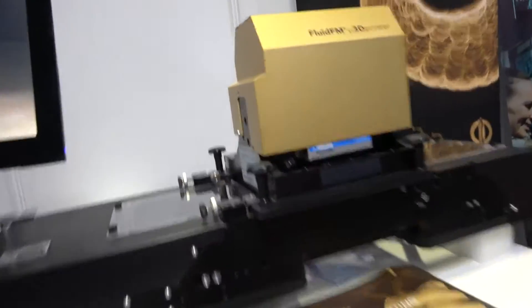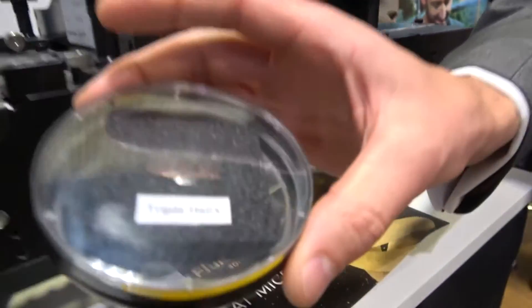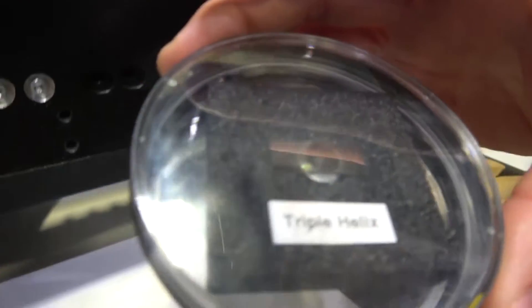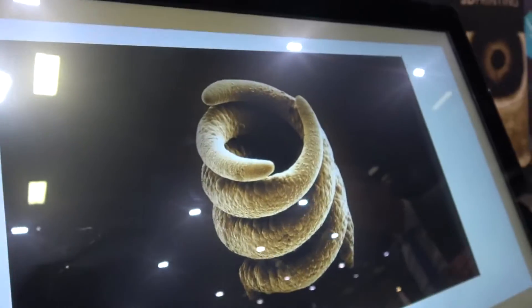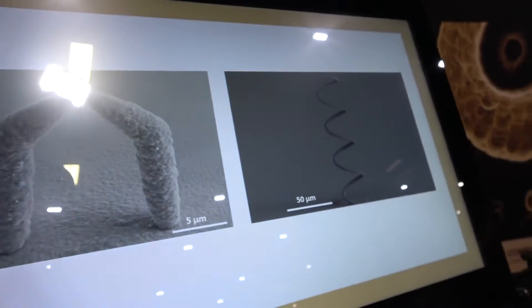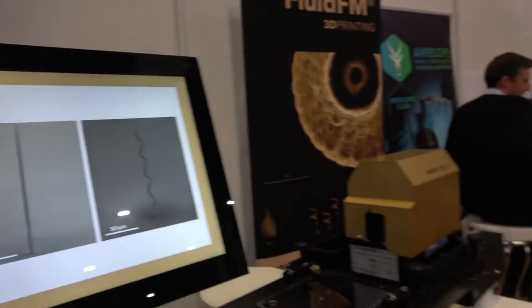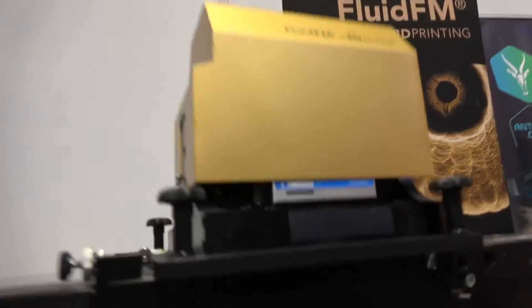And is this the sample that you have printed? Yes, for example, you see here — what you might not see — it's a triple helix. It's also on the screen; it's actually this one. It's a fairly complex 3D object with a diameter of 20–30 micrometers. It's a proof that we are able to print metal as 3D objects, because a triple helix is one of the most complex things you can print.